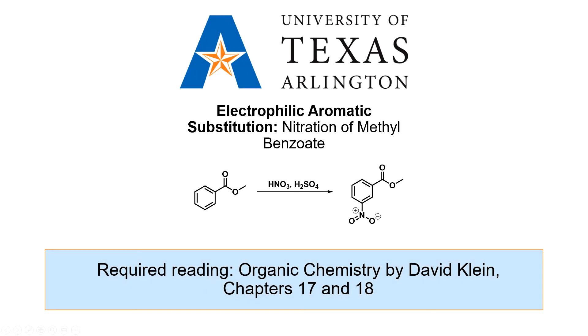In this experiment, we will use electrophilic aromatic substitution to add a nitro group to methyl benzoate.